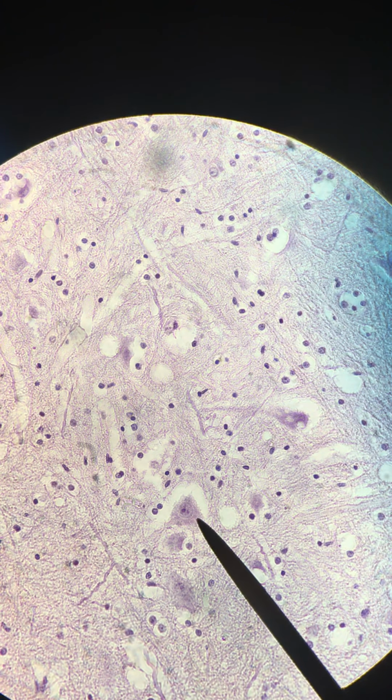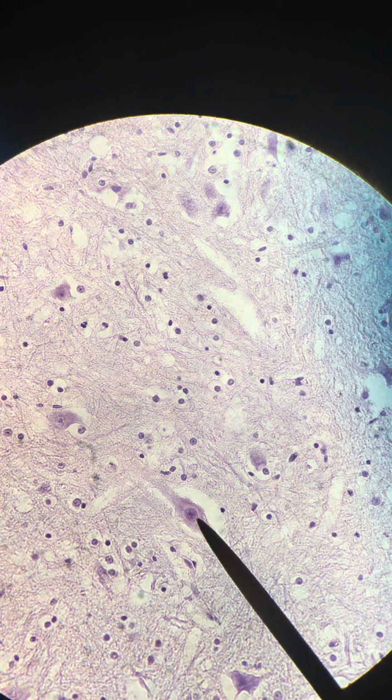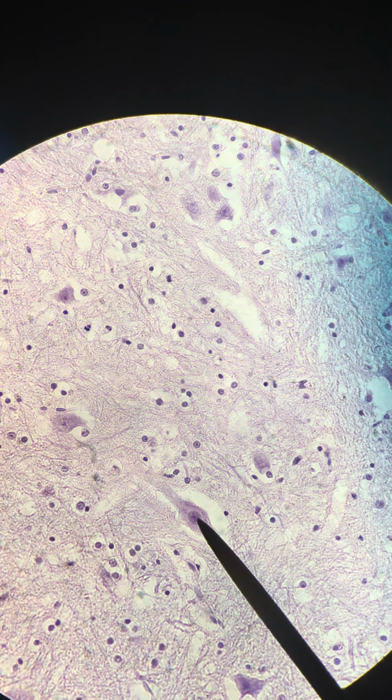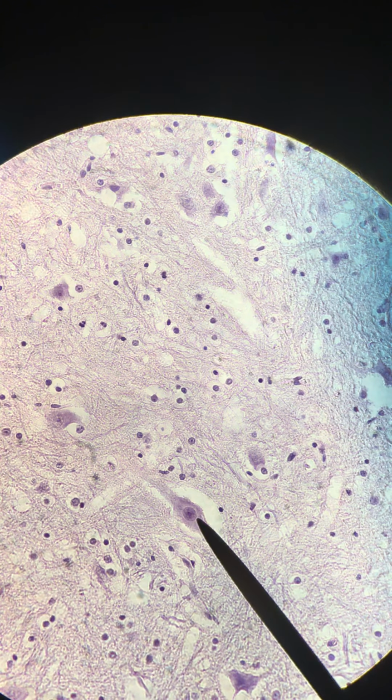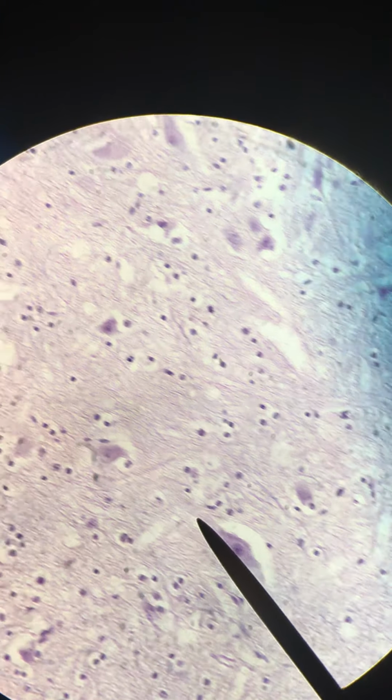Let's go see if we can find another good example too, so we can see that nucleus and nucleolus real well. Here's another good example. Okay, so here's another neuron. The pointer right now is on the edge of the nucleus, and that really dark spot in the middle is, of course, the nucleolus. Okay, and this is just another example. You can see a nice dendrite coming off here.